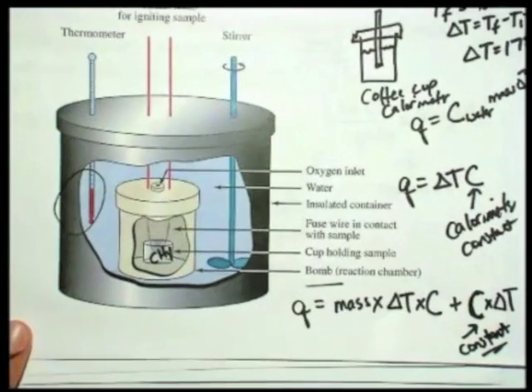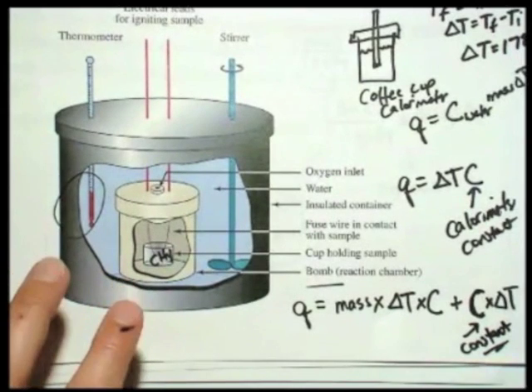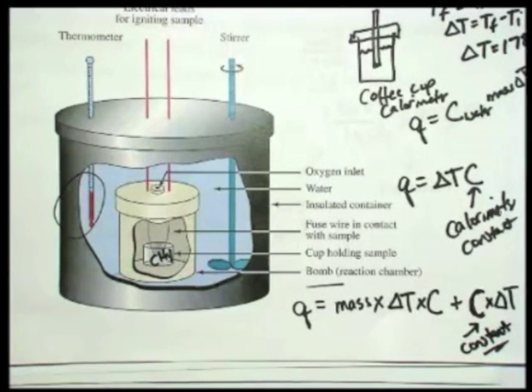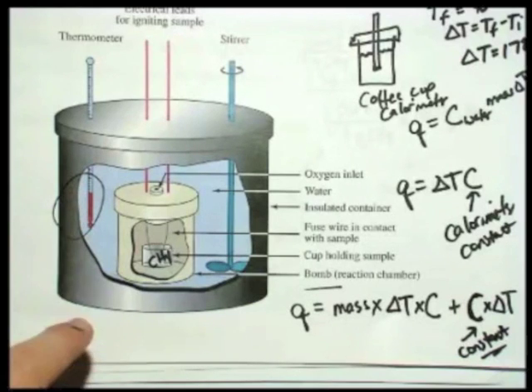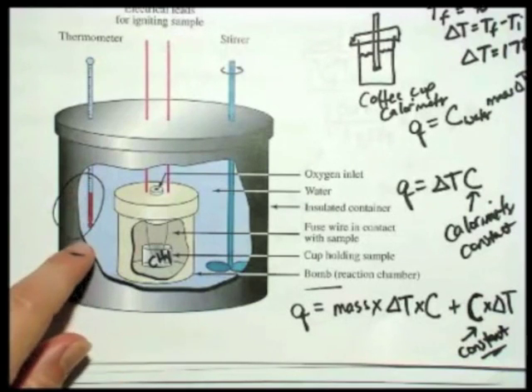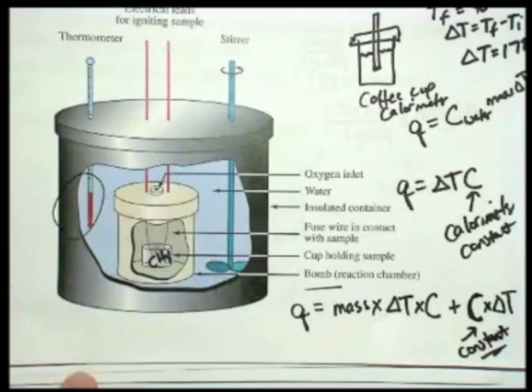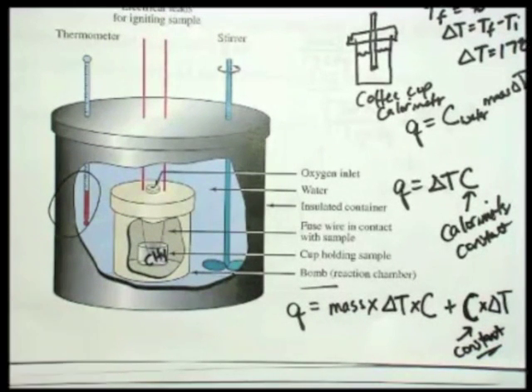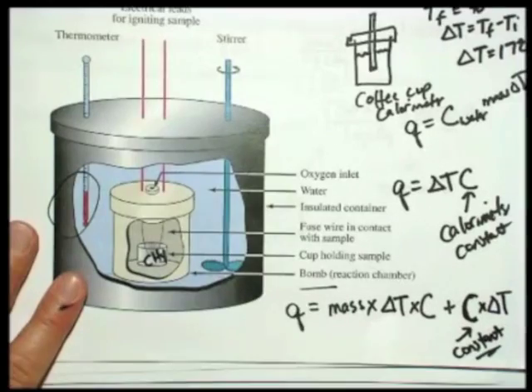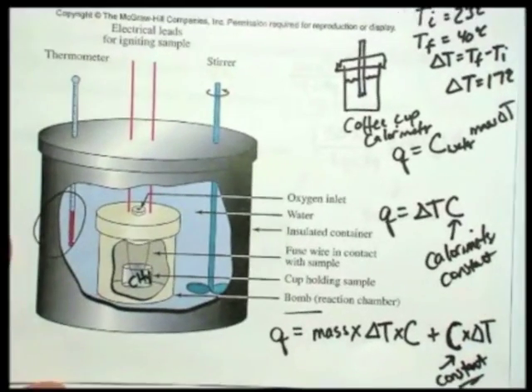The big idea behind all of this is the experimental way of determining the amount of heat that's given off by a certain chemical reaction. Now, if the temperature goes down across the chemical change, then that would tell you that heat is being absorbed from the surroundings. So in that case, energy is actually being absorbed by the reaction. Okay, so heat can be given off or absorbed.